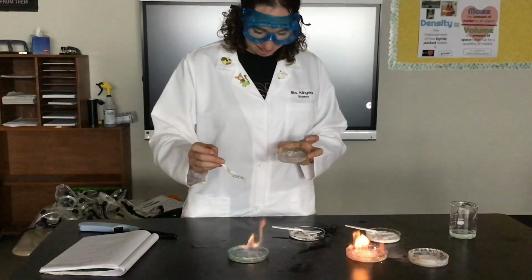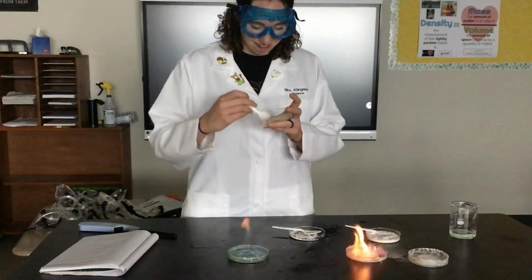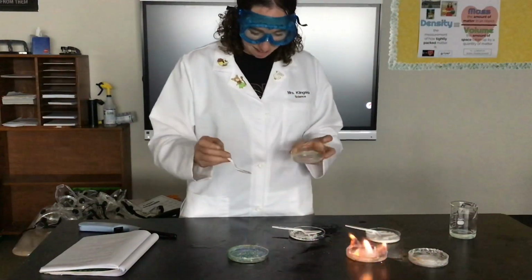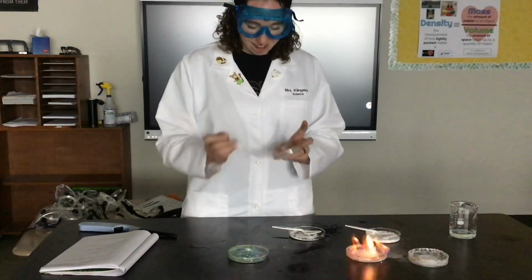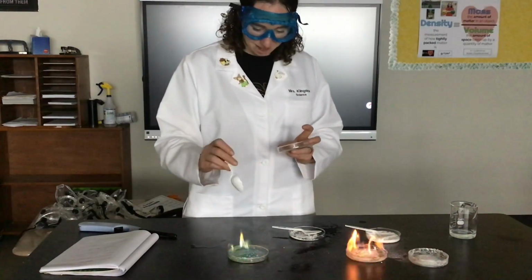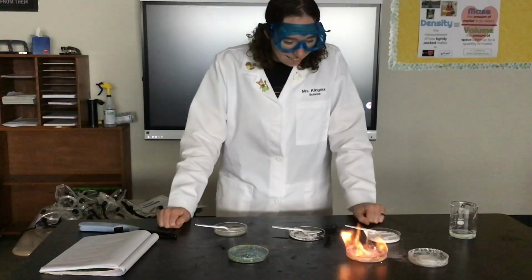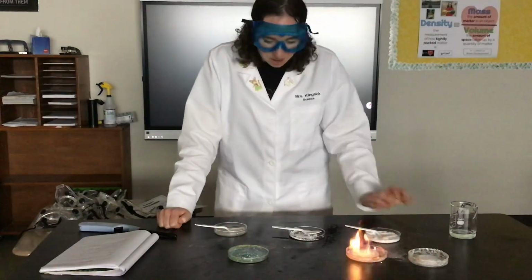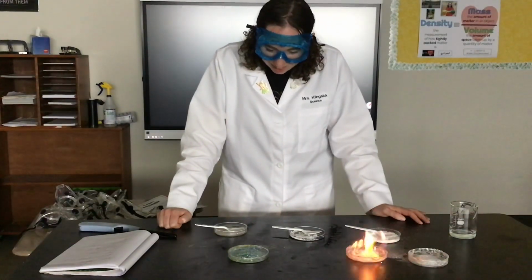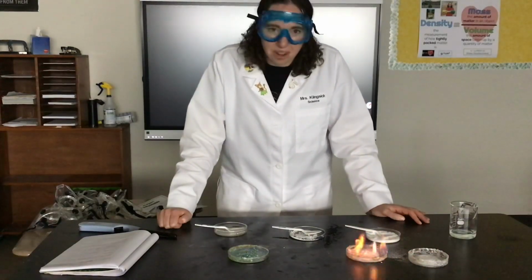Did you see the flames turn like green and blue? Isn't that the coolest thing? So that color change lets me know that what type of change is happening? Chemical. And that is the burning salts. Isn't that the coolest thing? Ooh, this one's going. Chemical changes are the best.